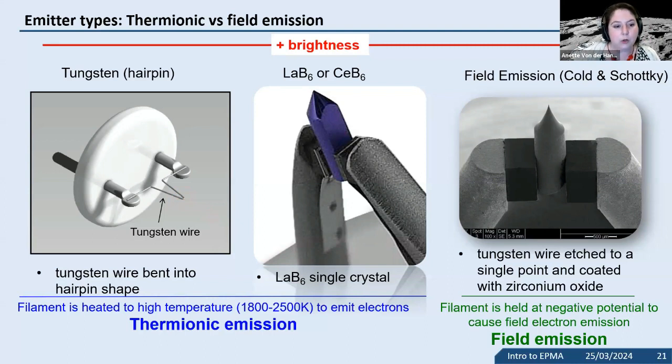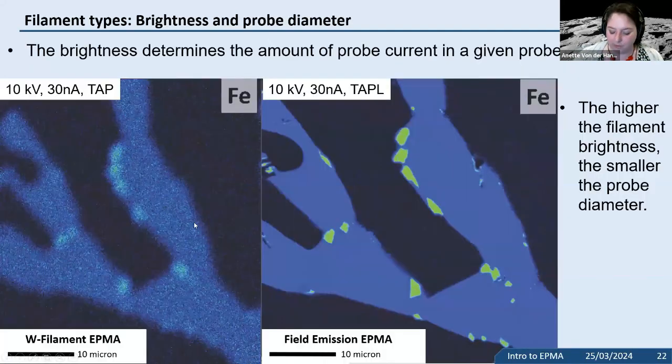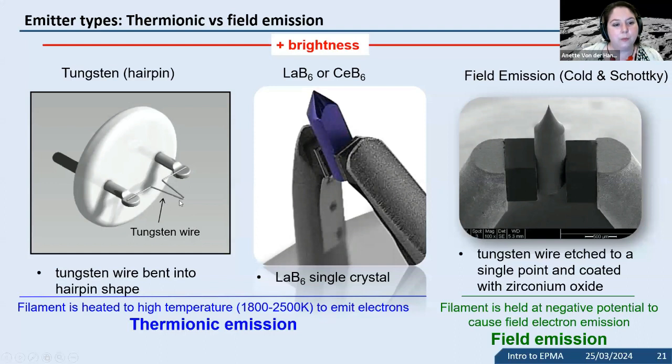And when I talk about X-ray analysis, we also have an inherent volume that we actually analyze, which is usually higher than the minimum size of the beam that we can generate with the tungsten. So it's still very, very popular. And the advantage is that it's relatively cheap to run, both when you buy the instrument, but also the consumables. And in addition, it is a very, very stable beam.